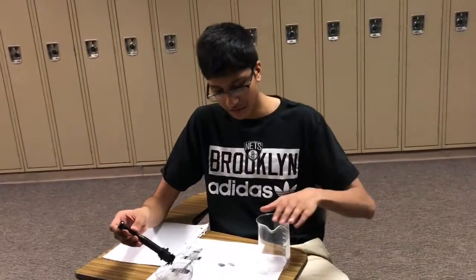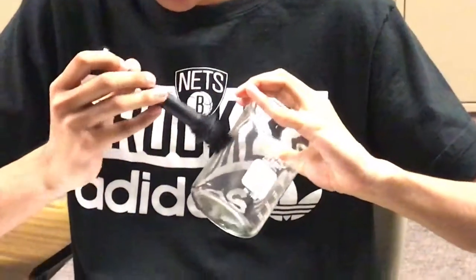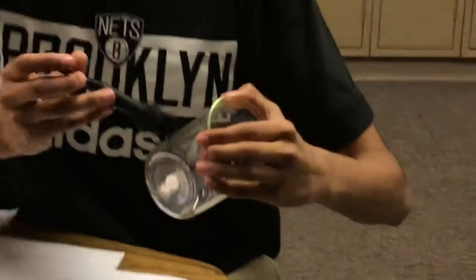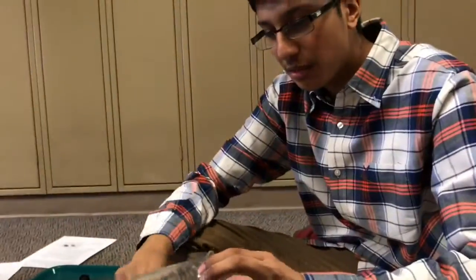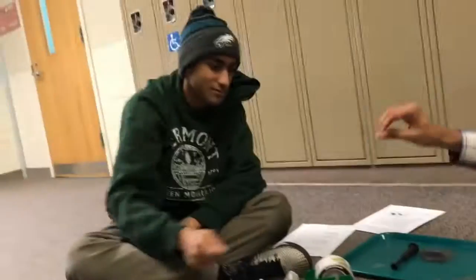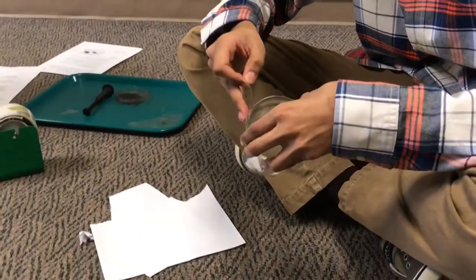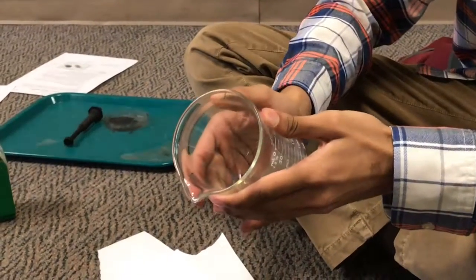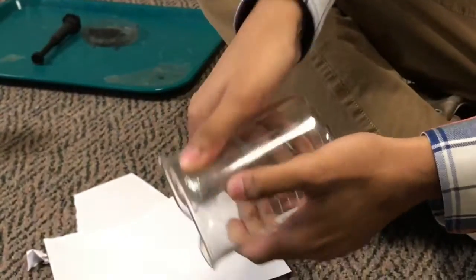And you want to take the dusting brush and sweep over the areas, rotate over the places that you went, and it should become visible. Okay, so right here we have a print on here, so you want to take about a 3-inch piece of tape my lovely assistant Jay has provided me with, and you just want to place it on. You want to apply pressure, try to get the air bubbles out, like that, right there.